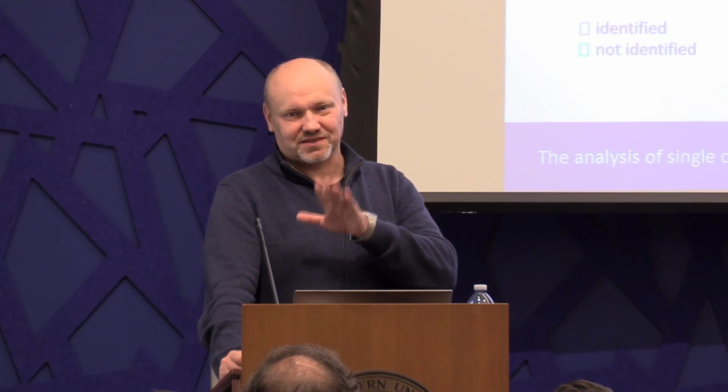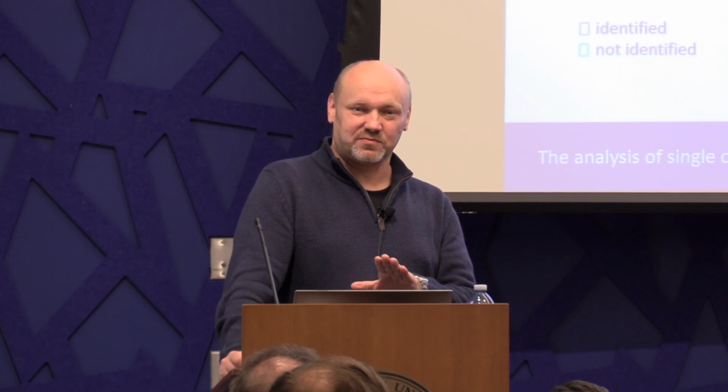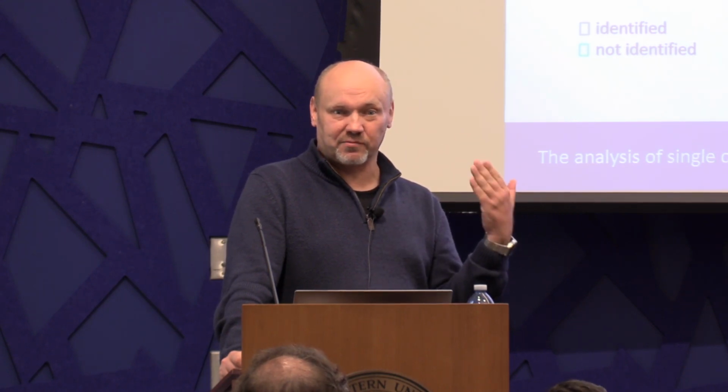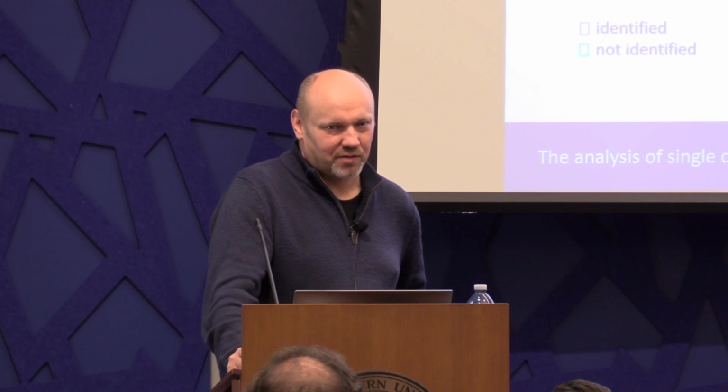I mean, there are ideas, I think we discussed this morning, to get exactly these PSMs that are low scoring, but in the same sample, by just allowing them in whenever it is the same top scoring hit as the one that is already identified, right? So that might also help a little bit. But there are actually more tools coming that one can throw at it later. And we will just integrate all of them, and by that hope to overcome the missing value problem as well as we can.